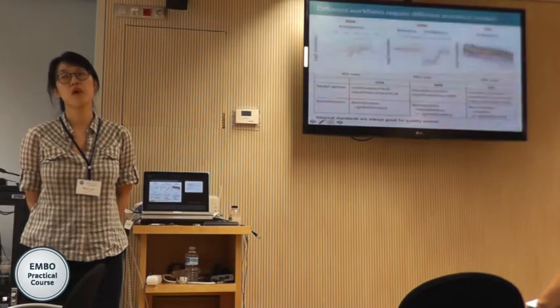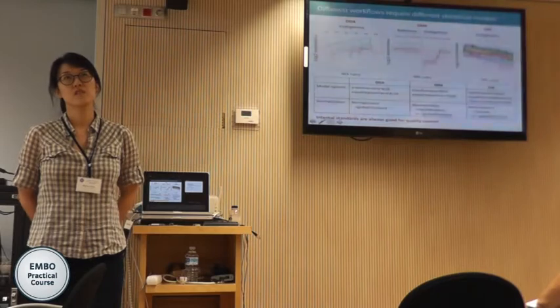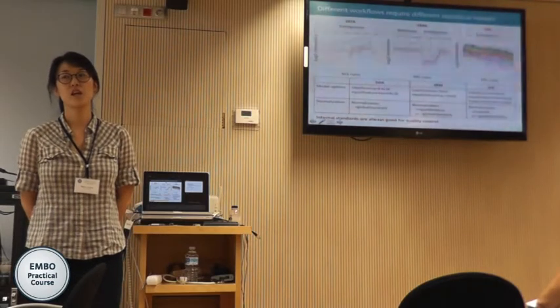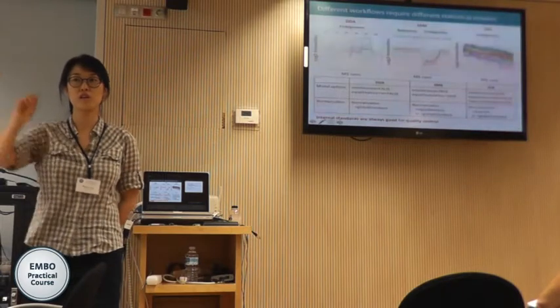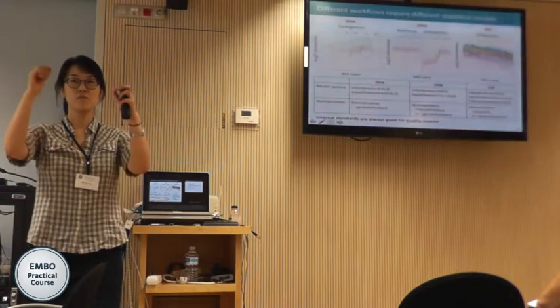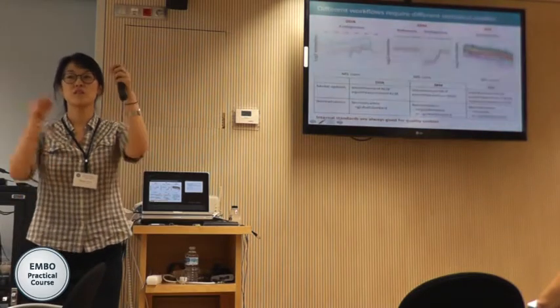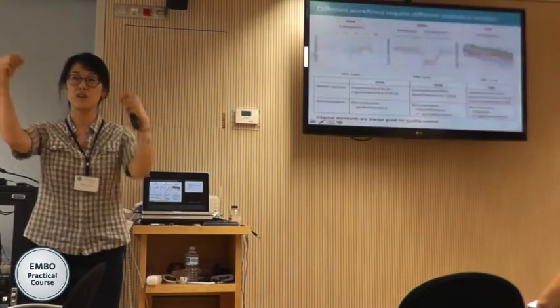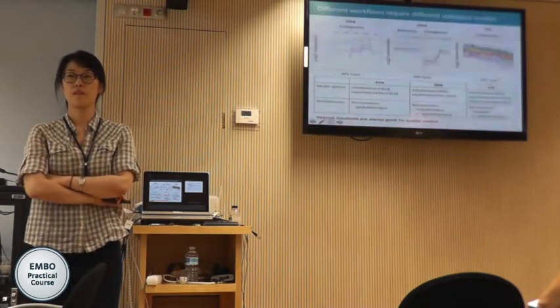So in that case, it's probably quantile normalization. But still, I feel like DDA data have a lot of missing values. Even though they have a relatively similar number of measurements, they are not from the same things, and so on. But what if your global protein standard has missing values too?